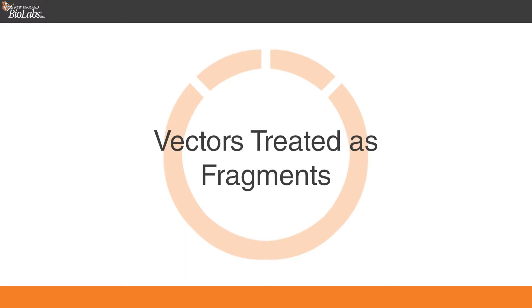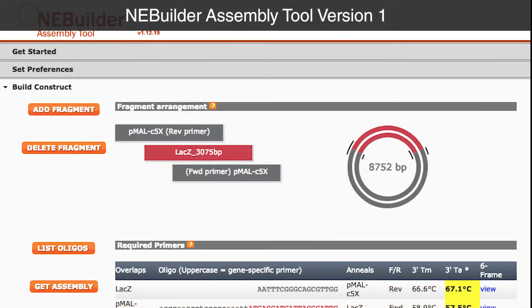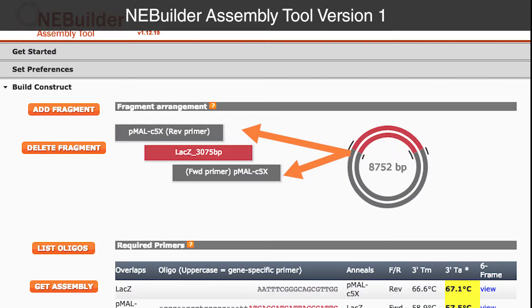Vectors treated as fragments. AnyBuilder version 1 was designed primarily to assist beginners with cloning an insert into a vector. The primary fragment view emphasized this by showing a split vector flanking the inserted fragment. Behind the scenes, AnyBuilder version 1 split the vector sequence into two fragments. This also affected the starting point of the assembled sequence.